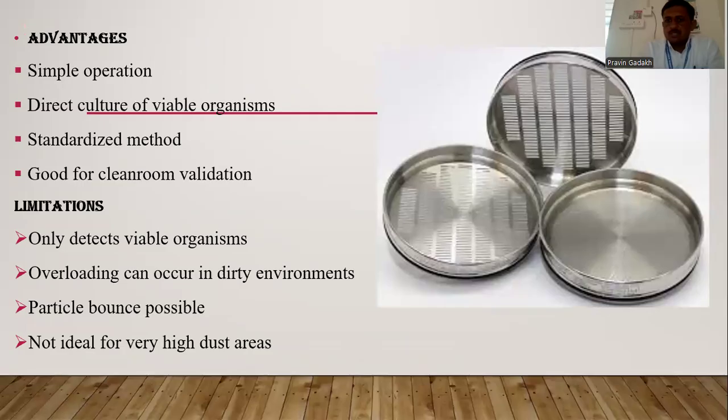Now, in the diagram, you can see the simple diagram of the sieve sampler. Only one single stage sampler is used for the inoculation of microbes. Apart from that, we can also use different methods where multiple samplers or multiple stages are used, and that we can call a multiple stage sampler.